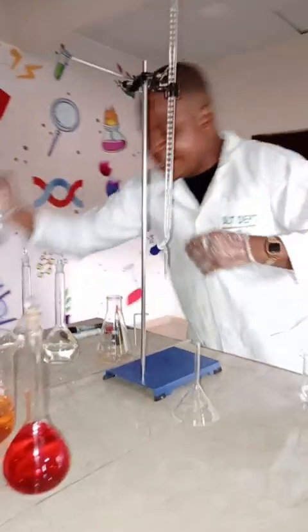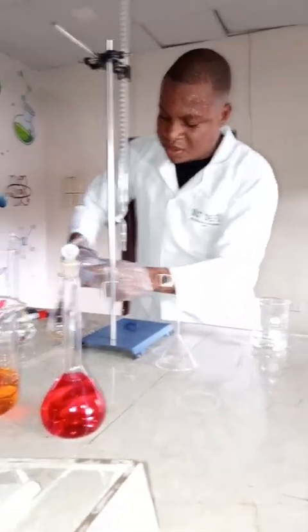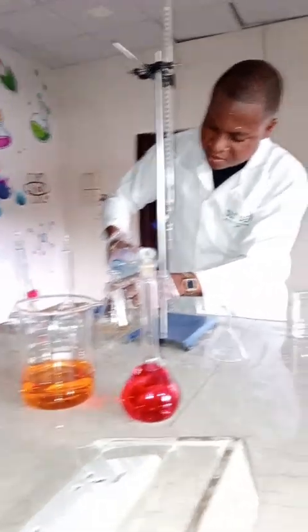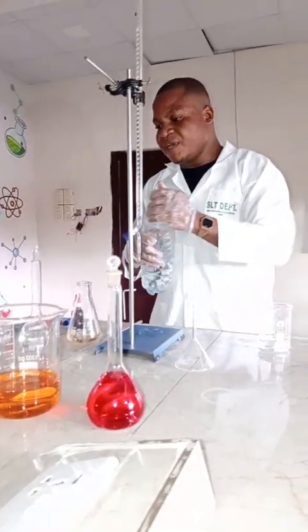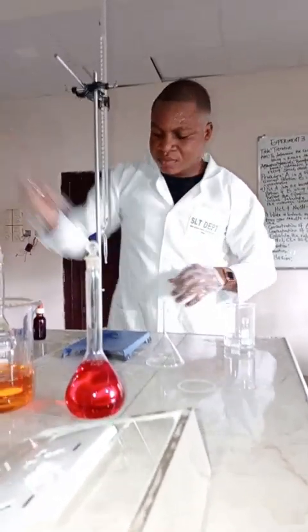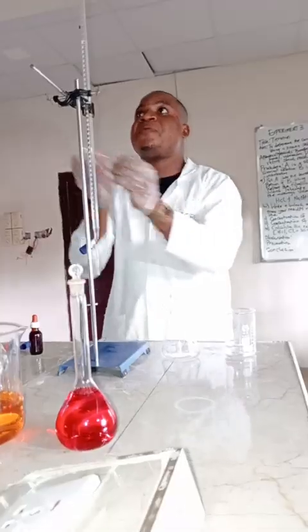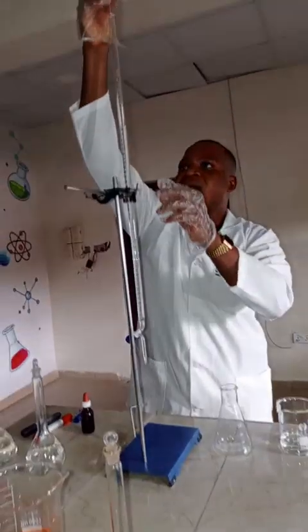Now I'm going to rinse again with distilled water. Rinse my conical flask with distilled water. With the aid of the funnel, I'm still going to fill up to the 0 mark.